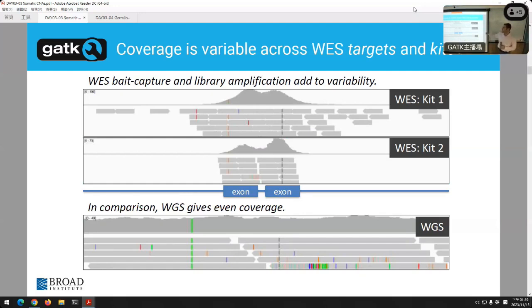And you can see as an example here, very different profiles. Look on the middle one, the 2 exons, one has a lot more coverage than the other. Now, this doesn't necessarily mean there's a copy number event here. This is what we have to contend with. This is what we deal with. And this is where the math is going to target. Clear? Good.